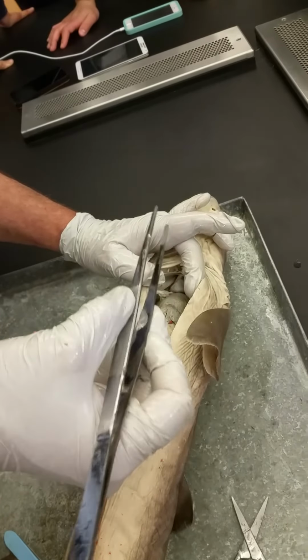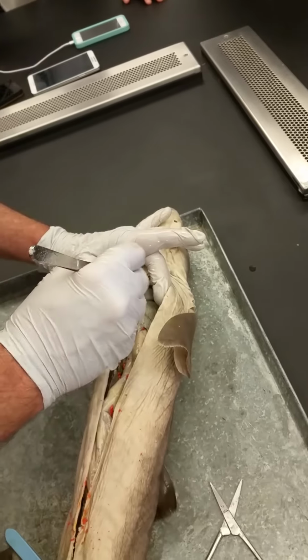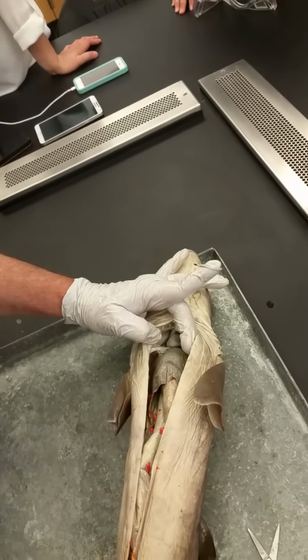It's gray because it's preserved. This is a preserved specimen. It's a fairly muscular structure, again for pumping blood to the gills and from the gills to the rest of the body.